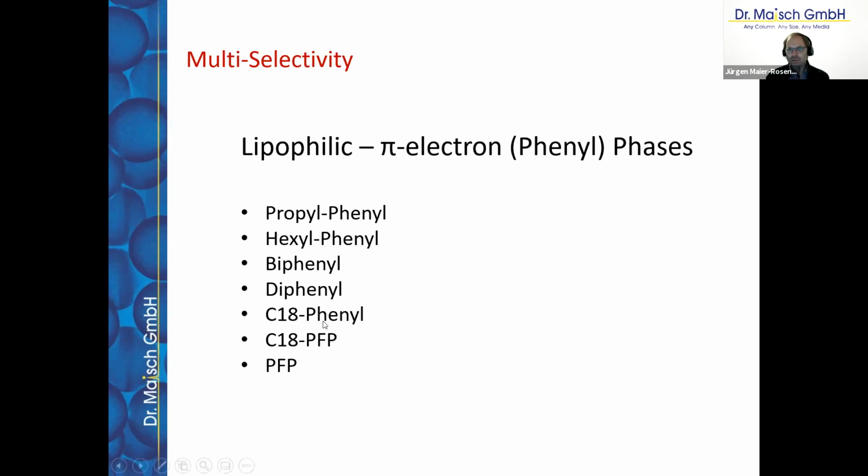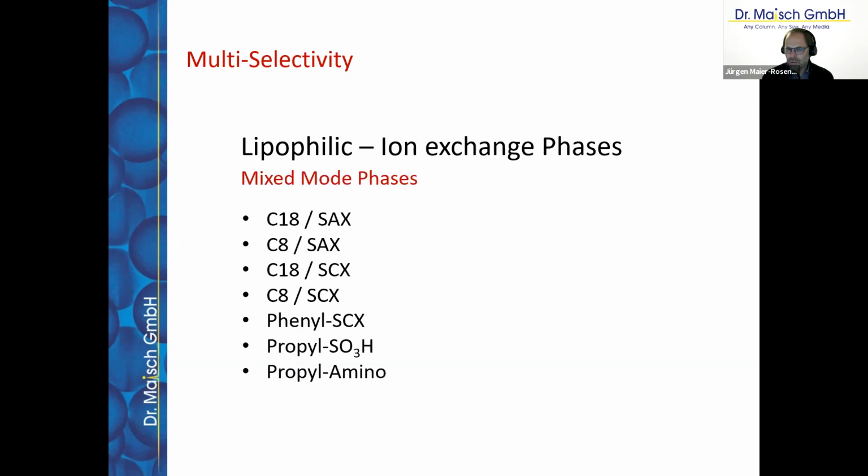Then we have a mixture, the C18 phenyl, and a pretty interesting phase is the C18 PFP. PFP means pentafluorophenyl, and of course, it's also available as a pure PFP phase. So let's go to the third block of phases.